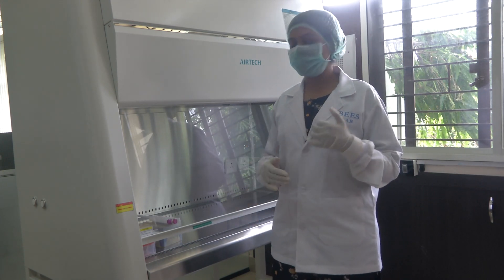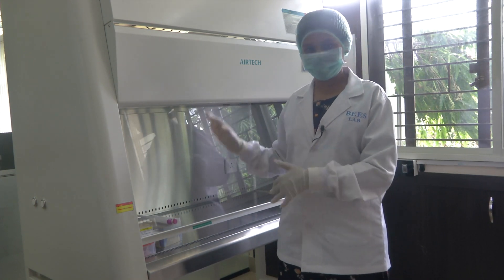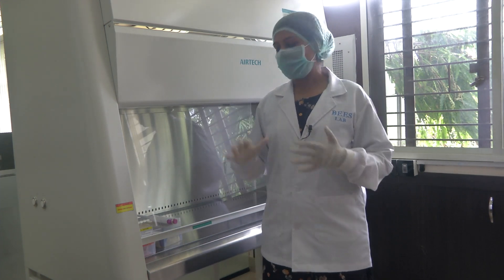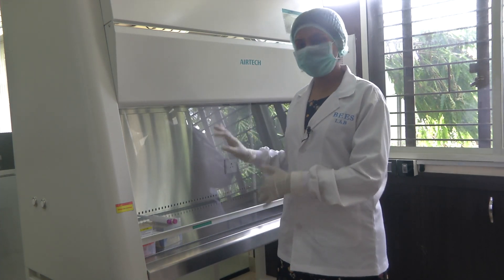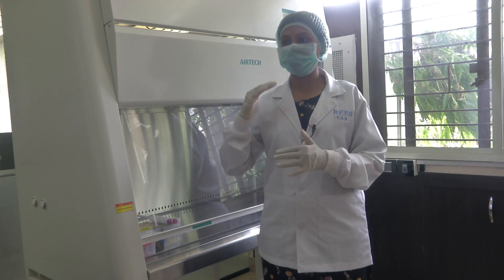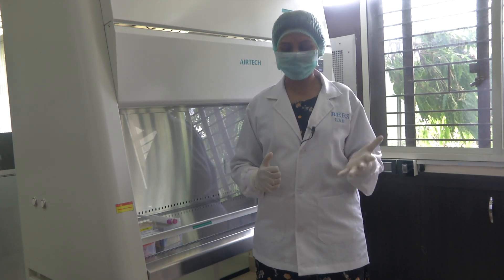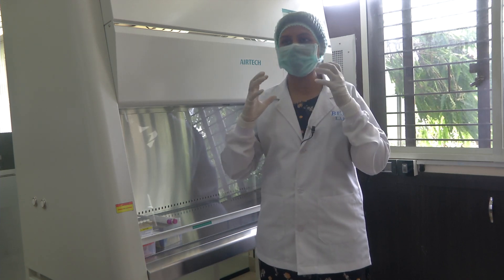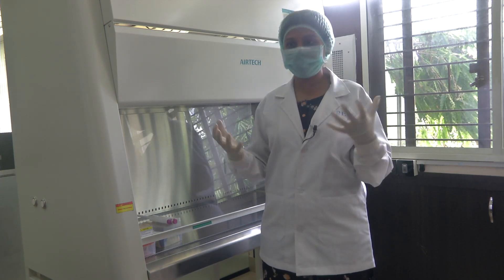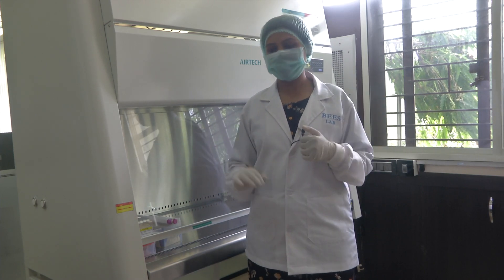For class 2, which this device is, the biosafety cabinet provides product, personal, and environmental protection. We will get into the details about class 2 since we have it here. There is also BSL class 3, which is for really sophisticated environments — when you are working with hazardous pathogens and chemicals and are very stringent about containing pathogen safety within the working environment. In that case you use the BSL class 3 safety hood.